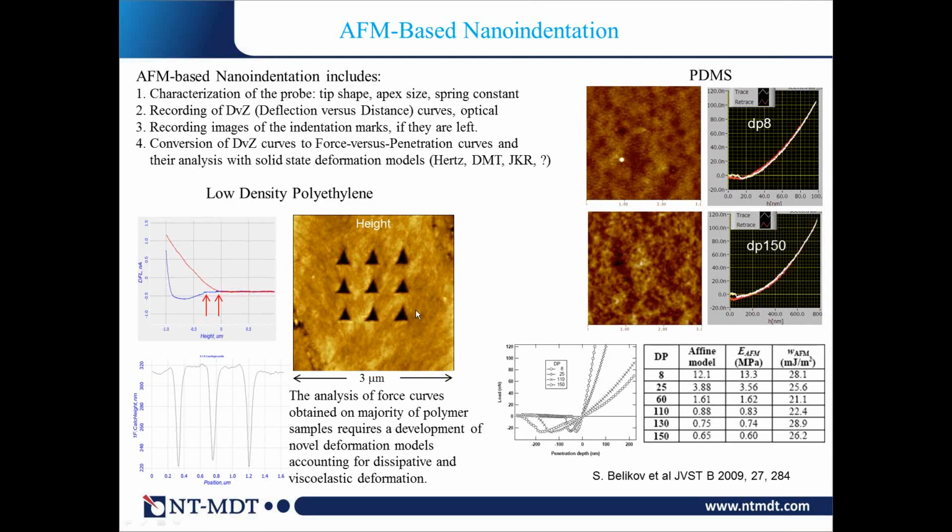to the viscoelastic response. However, all these formulas, which are listed here, stay in the case where people assume that the deformation is conservative. There is no energy dissipation in that. It means truly speaking you can only do that in first approximation. But to understand that, to get dissipative and viscoelastic deformation, we need really to do that carefully. We need to spend more time to work on better models to describe that and get numbers.